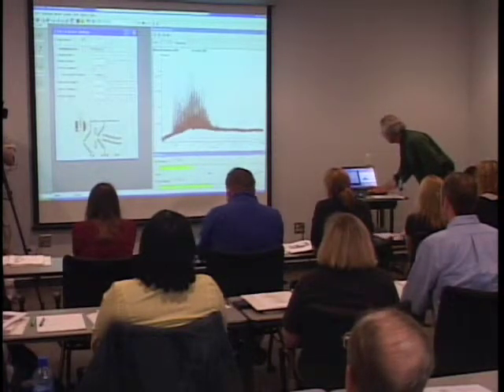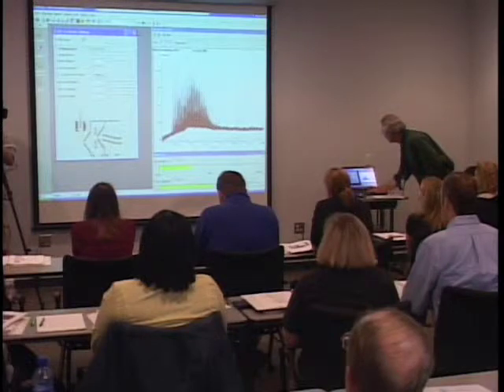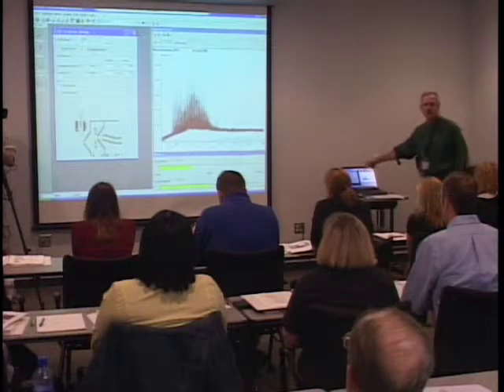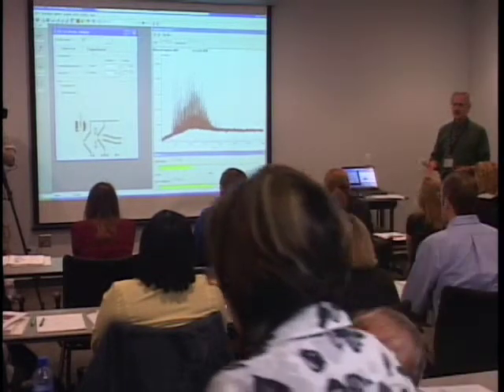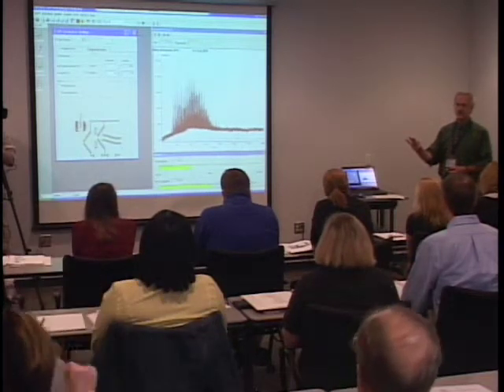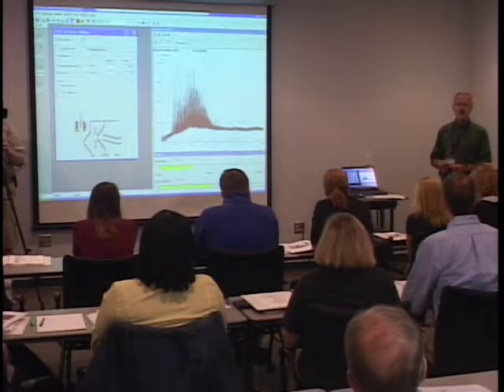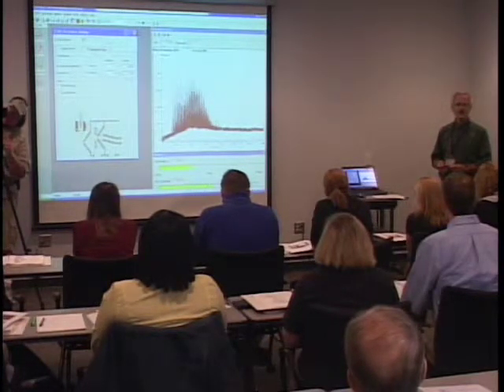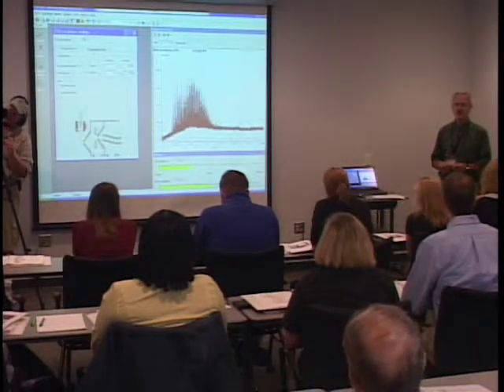Ignore the needle voltage — there's no electrospray needle. The orifice voltages are all set the way you like it. The orifice temperature is set to 80 degrees C. You do want to heat the orifice — it contracts the hole a little bit so that you don't blow too much helium into the vacuum system, and it also helps to keep things clean. The number is somewhat arbitrary; I started using 80 in my lab and now I'm doing 120. Just stick with the same value and you'll be fine.